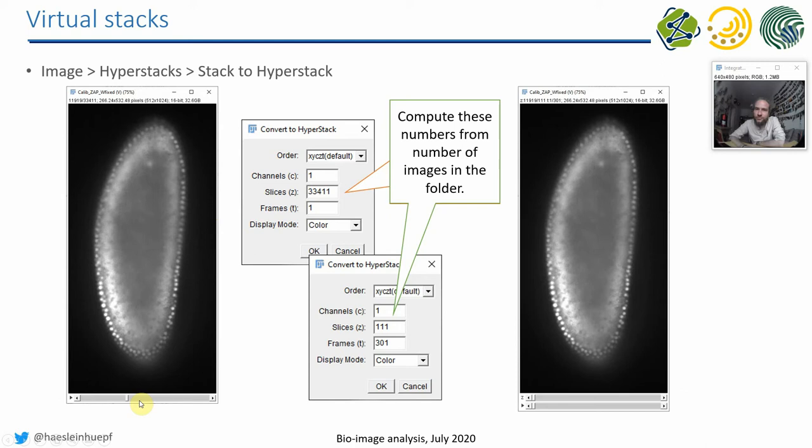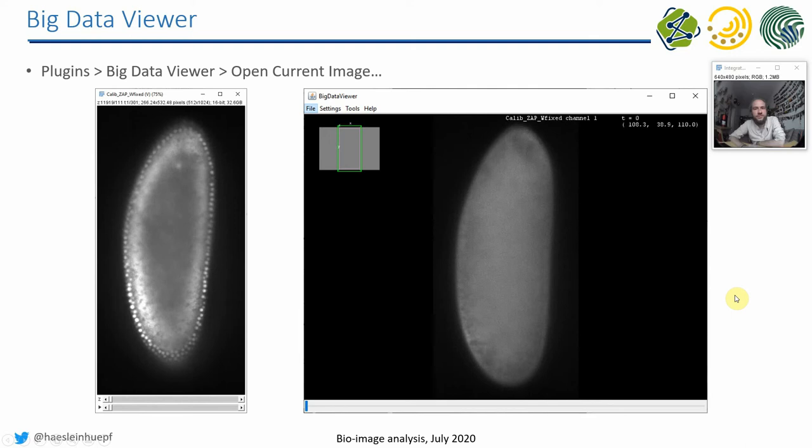You have to convert it from 33,000 slices to a given number of slices and frames to have these two bars down here and be able to browse through this dataset in space and in time. You can compute these numbers, and I will show how to do this later.